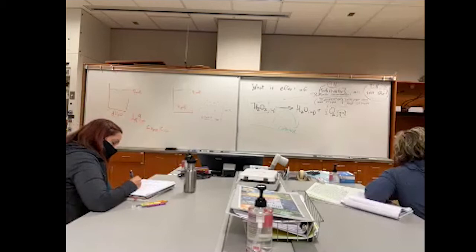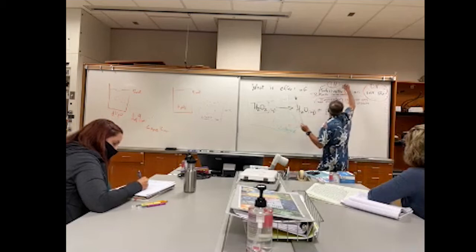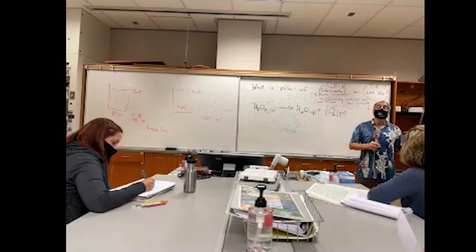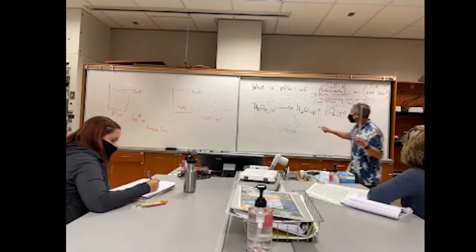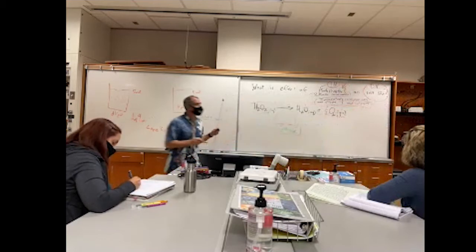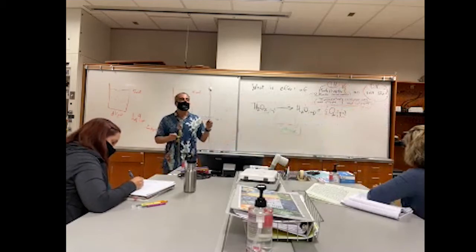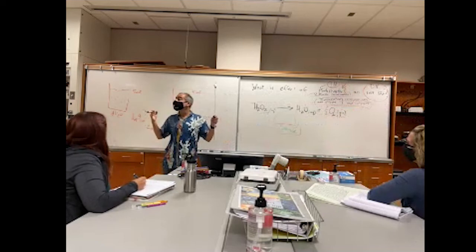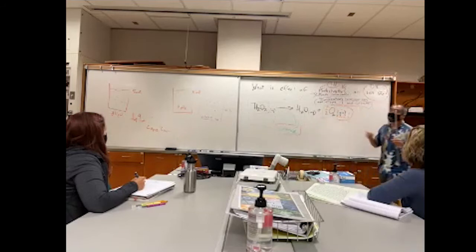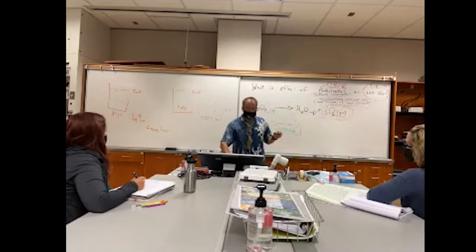So the first step is we'll pick a particular substrate concentration that we're going to do for some trial. And we talked about enzyme held constant. We're going to have our set amount of enzyme in the picture. And then we're going to get this thing to run. And we're going to see the bubbles being produced. That's just the first step, though. That's still not a reaction rate.